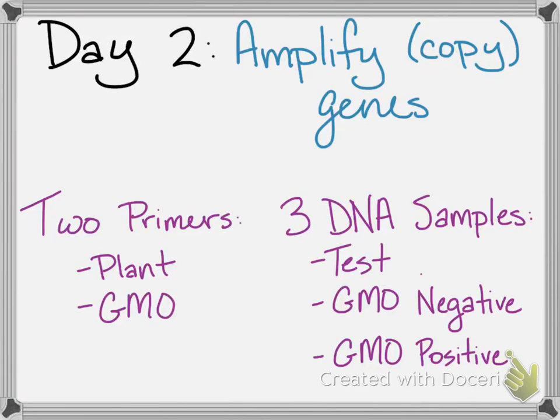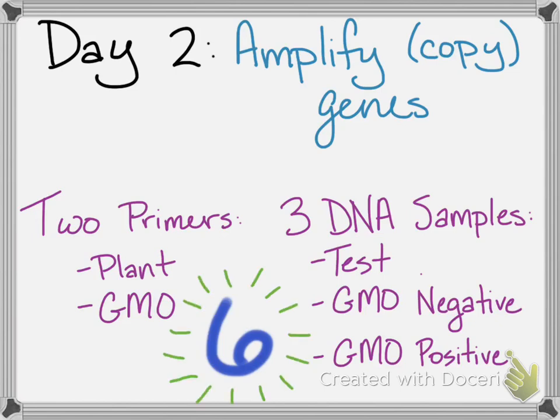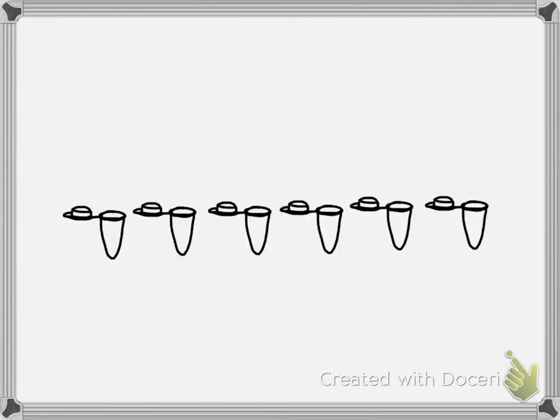So 2 different primers must be mixed with 3 different DNA samples. That means we're going to need 6 PCR tubes that we're setting up per group. So here they are, our 6 tubes. You're going to label them because there's not enough room on the tubes to actually write what's going in them, but everything's going to look pretty similar, so be sure to write numbers on the top of the lids. Also, write your group number because everybody's numbers are going to be the same, so I would add group numbers to the beginning of those numbers.